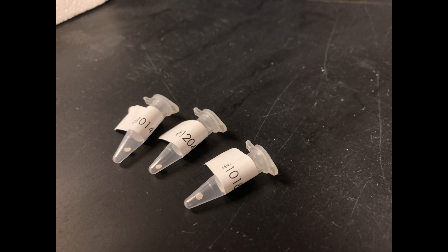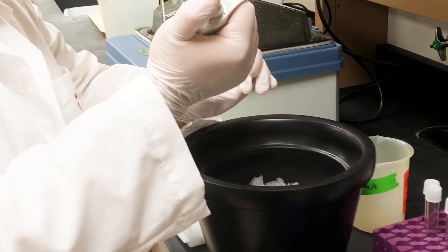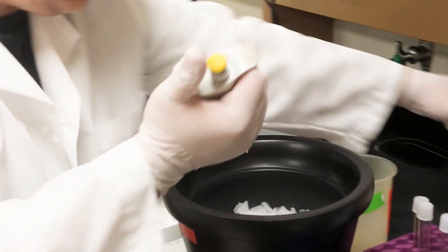However, it is also important to note that if the TE sits on the disk for more than one or two seconds, the DNA will elute off and will be lost, resulting in a failed transformation. Add 50 microliters of competent cells and incubate on ice for 30 minutes.